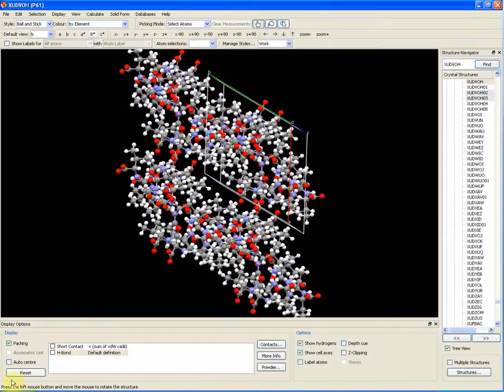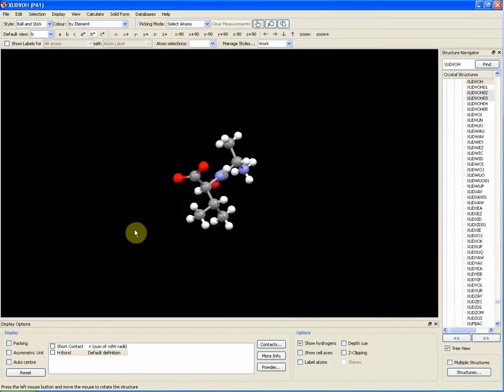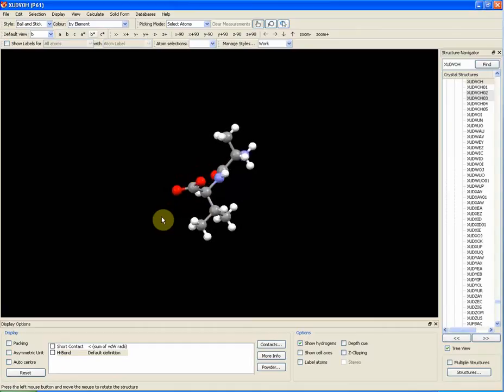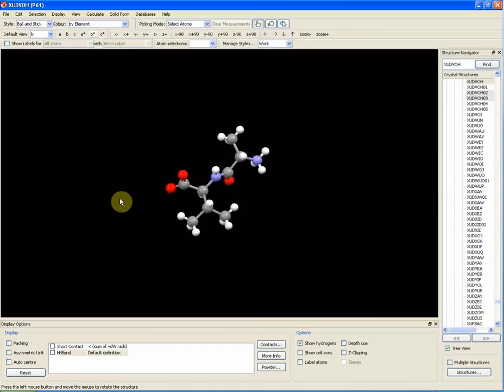Using the void option allows you to see if the channel is either smooth or textured.